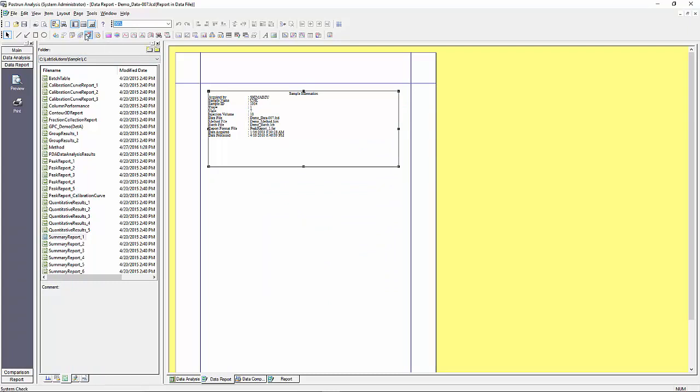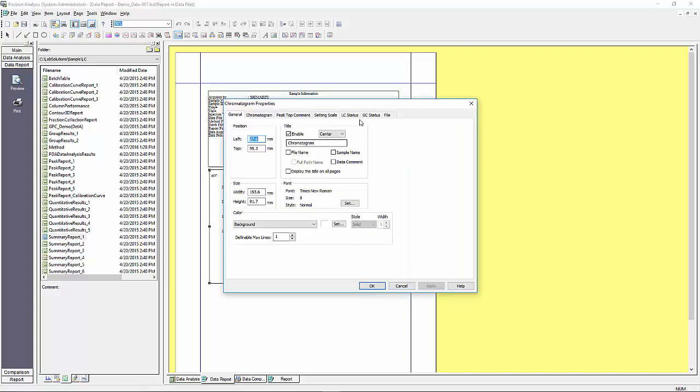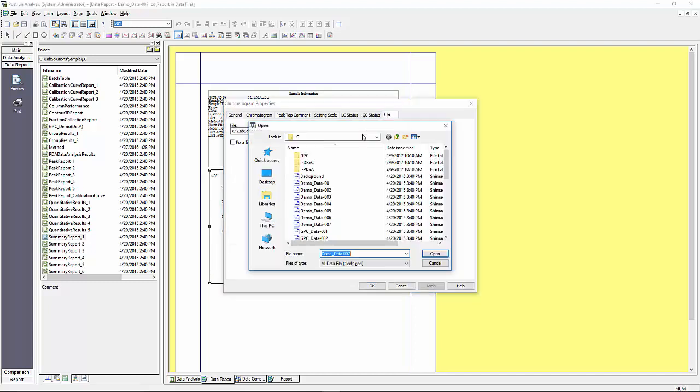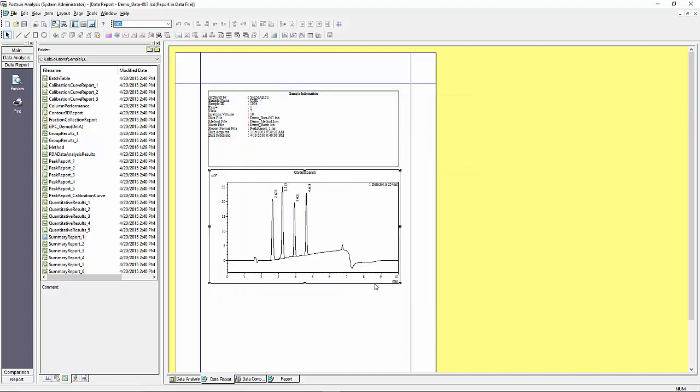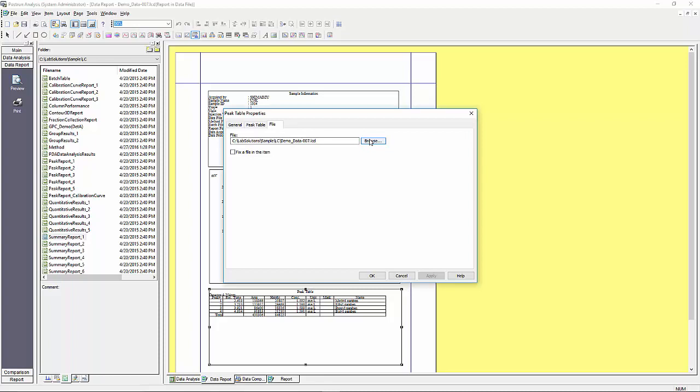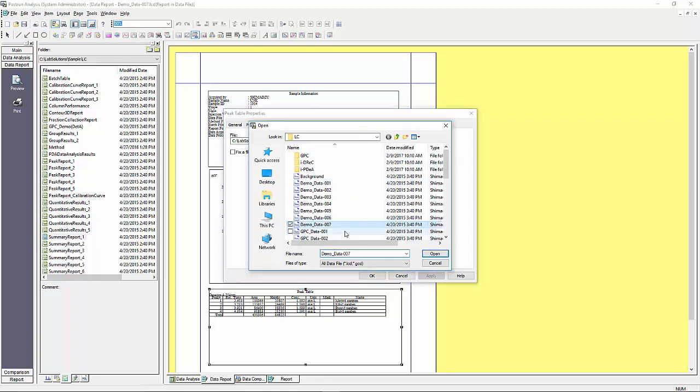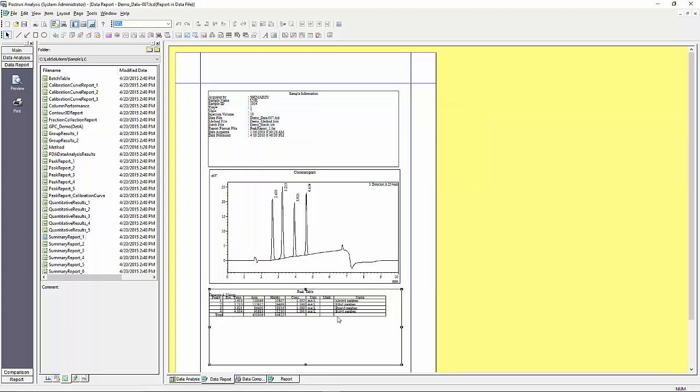In this example I am recreating the basic components that are already included in the default data report template that we began in this video with. Notice that each time I create an item I need to select the data file to populate it. Once I have the data file selected I can go in and change the properties to adjust the view as I wish.